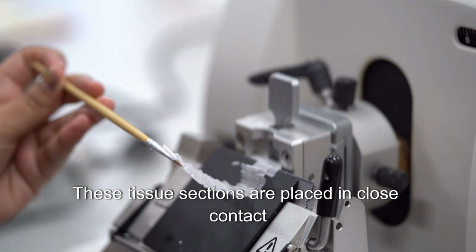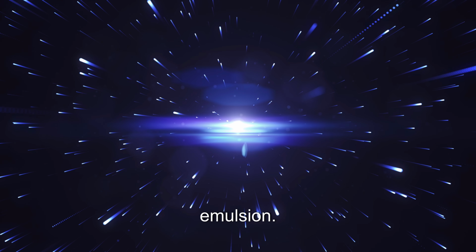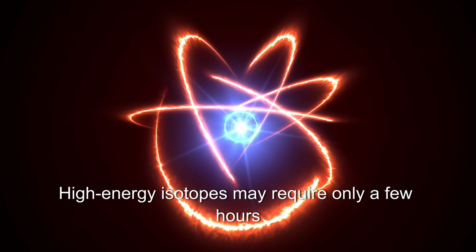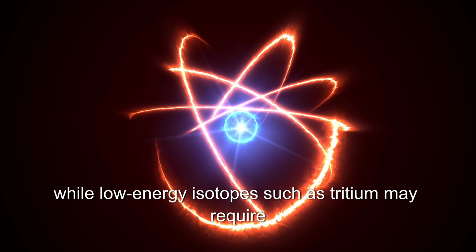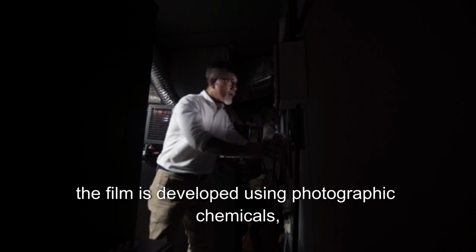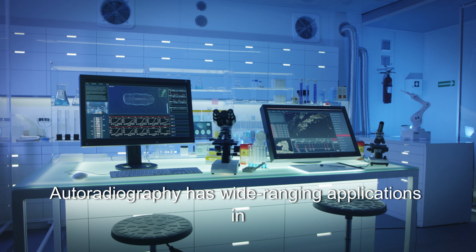These tissue sections are placed in close contact with photographic film or coated with a radiation-sensitive emulsion. The exposure time depends on the type of radioisotope used and its energy. High-energy isotopes may require only a few hours of exposure, while low-energy isotopes such as tritium may require days or even weeks. After exposure, the film is developed using photographic chemicals, producing an image known as an autoradiograph.